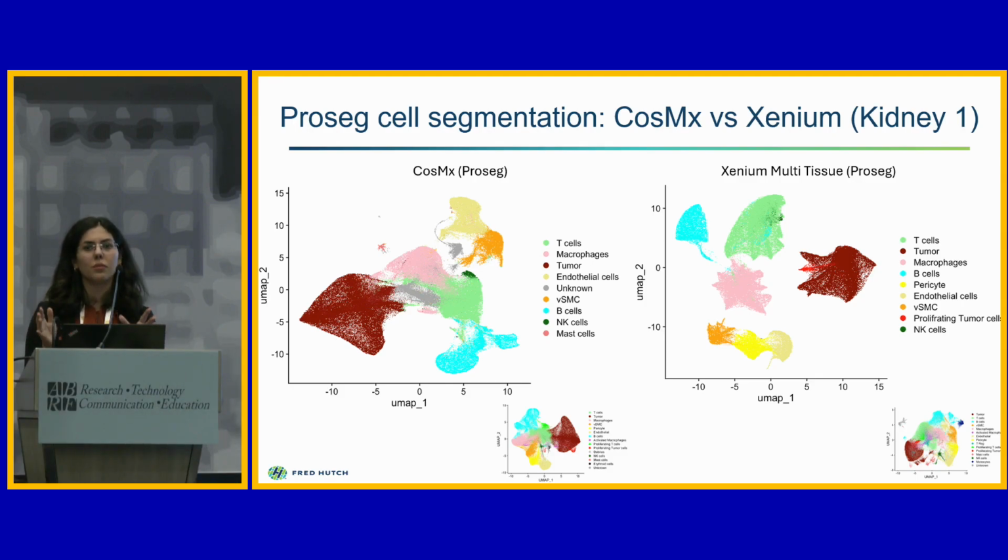It is most similar to Baysor. Baysor is based more on where the transcripts are located. The difference our method has is that it also uses the DAPI images for the nucleus. So it doesn't call a bunch of transcripts that are somewhere but don't have a nucleus next to them a cell. But after that, doing the clustering and the UMAPs, that is still unsupervised machine learning, so it shouldn't be affected by the segmentation method, I believe.